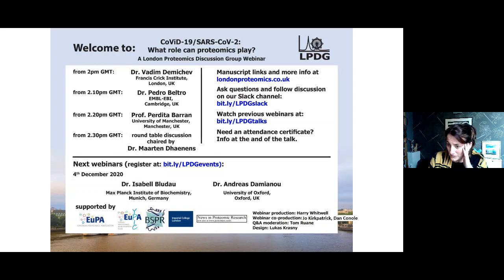I have to say, and there's another question about this too, you really have to think about end-to-end. So we are talking about something that is for mass scale-up, which is very, very different to what anyone has done before. I admit, of course, the biotypers are doing this for bacterial strains, and that's fine. But that is from clinical isolates. So we are talking about mass testing. It's just like a scale beyond that kind of thing. So I'm sorry, that's not to say anything about MALDI. MALDI could be a fantastic method of doing this, but the considerations are less about the mass spectrometry and more about how we can sample from people and how we can get those samples from people to labs and how we can process the samples and get them onto the mass spectrometer. The mass spectrometry part is quite simple. Everyone should think about that part of things. It's really about the ease of applying the test and transferring the material.